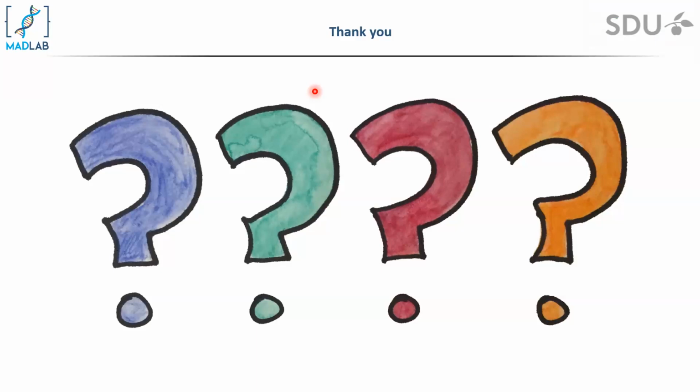Thanks, that was an interesting talk. I had a question about your first part, where you summarized expression similarity. You mentioned in your paper too that if you were to work with a pure cell line, valiDrops has issues with that data set. Is that general, or if there are expression differences in the cells within a sample from a cell line, will valiDrops still work?